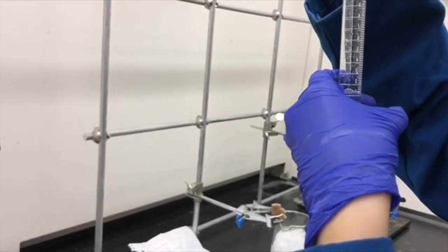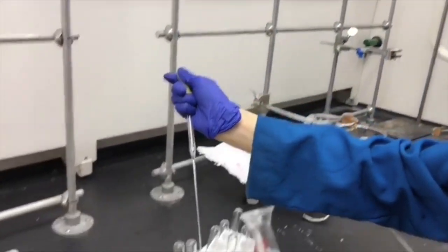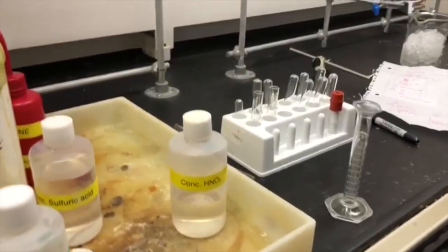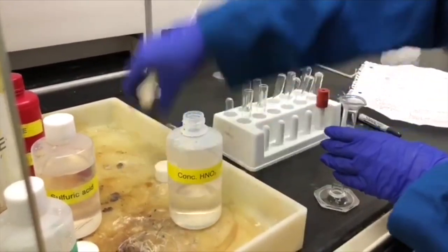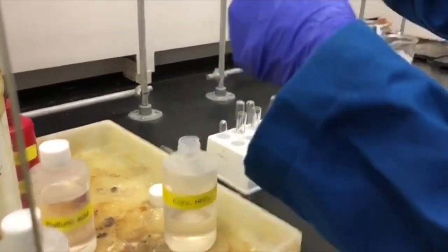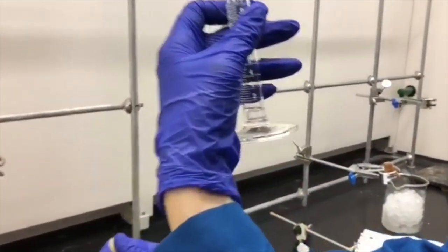This is the second part of the lab where we nitrate methyl benzoate. We're doing the exact same thing as before, but here we use methyl benzoate in place of acetanilide. So again, I measured out 0.5 mL of nitric acid and pipetted it into a test tube, and now I'm going to pipette out 0.6 mL of sulfuric acid and pipette that into the test tube as well.